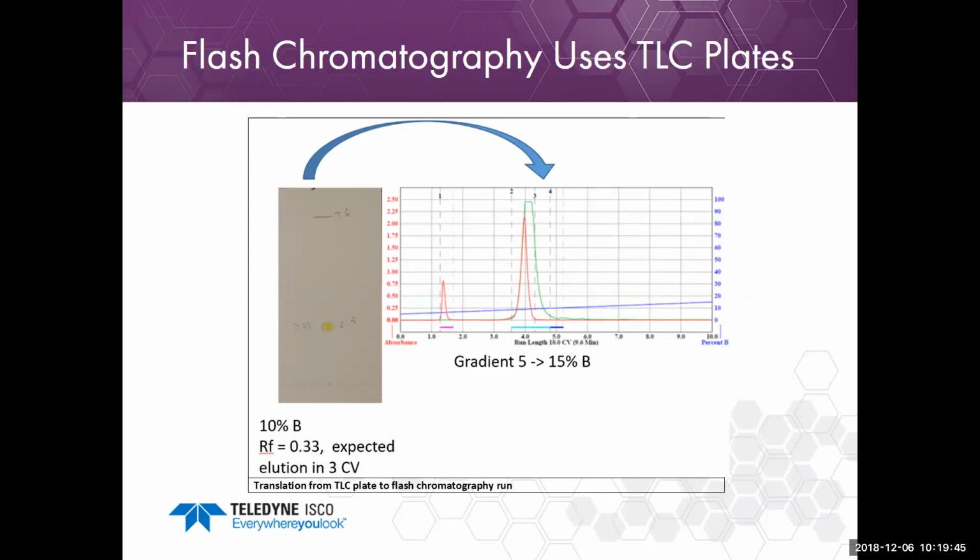Okay, C18, you can run a TLC plate. It will take a very long time. So what we will do is a scouting run.